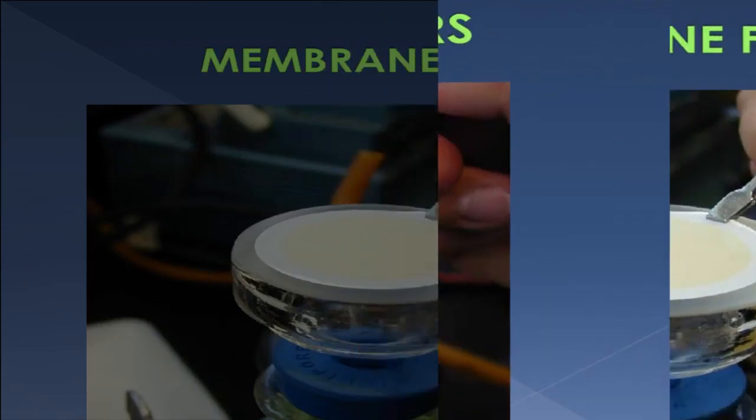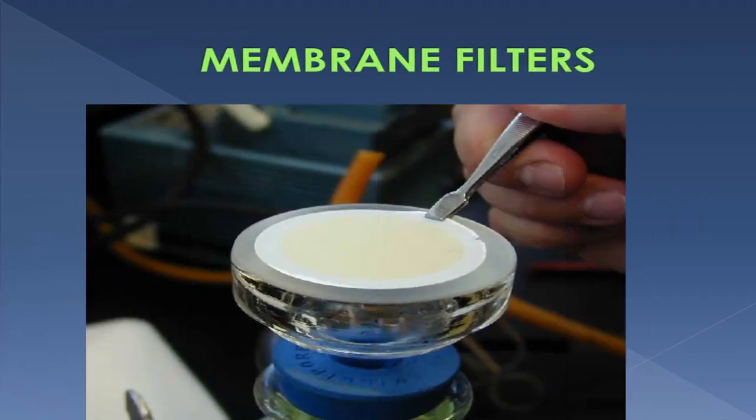Next is the membrane filter. Membrane filters are thin filters that are made of cellulose. They can be used for sterilization during injection by placing the membrane between the syringe and the needle. Membrane filters have a uniform porosity of predetermined size, sufficiently small to trap microorganisms. Using the membrane filter technique, the sample is passed through the membrane using a filter funnel and vacuum system.